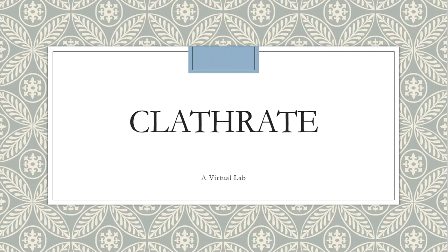So we're getting ready to do another lab together, and this one's called the Clathrate lab. Pretty simple on a sheet of paper, however, it seems like this is the most amount of slides that I've done for a lab so far. Go figure. Okay, so the Clathrate lab, I don't have to say a lot about it. If you've watched the pre-lab videos up to this point, you know what a Clathrate is supposed to be. And we're going to be making one in a lab, and we're going to be using one to separate two alkanes from each other. Alright, so what are those two alkanes?